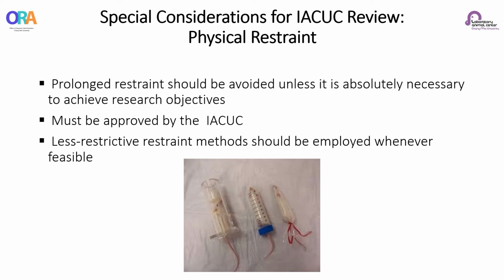Observations of the restrained animal should be made at appropriate intervals during the period of restraint. Veterinary care should be provided if lesions or illness occur and may necessitate temporary or permanent removal from restraint. And personnel involved in this study should be provided with a clear explanation of the purpose and duration of the restraint.